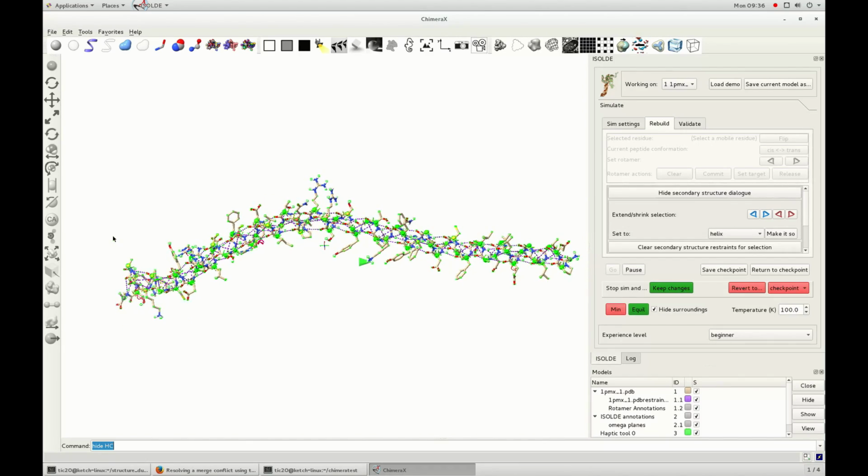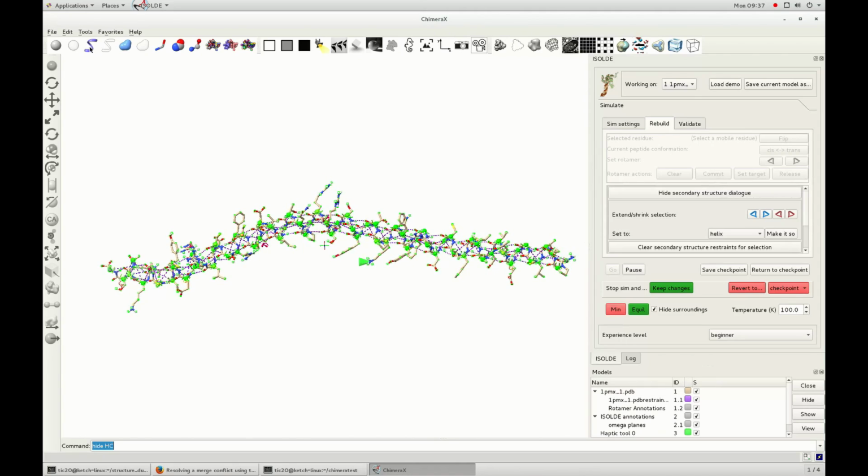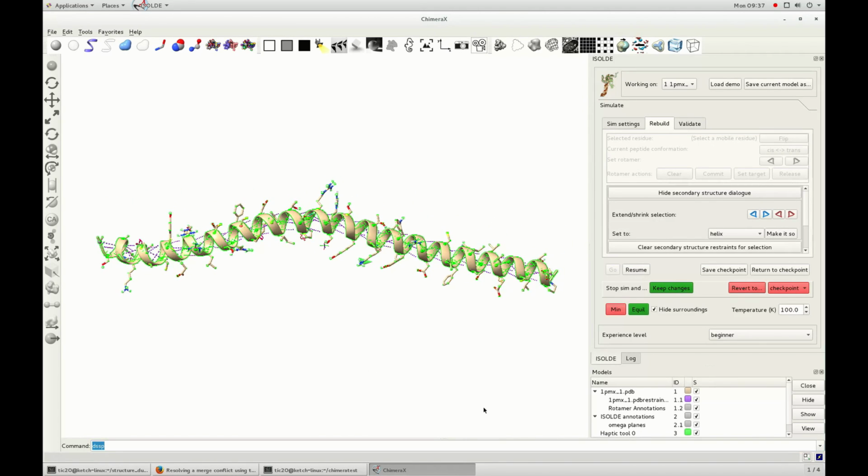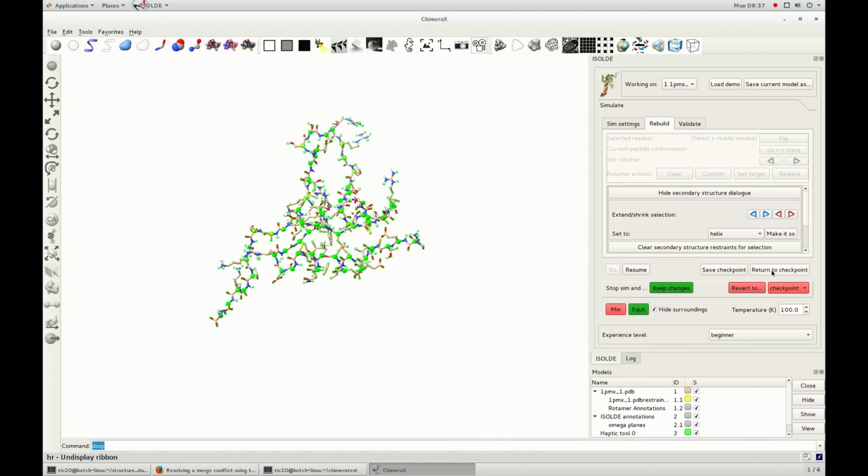And now you know what IGF-1 looks like as an alpha helix. Just to really demonstrate this, I'm going to briefly turn ChimeraX's cartoon representation back on and recalculate secondary structure using the DSSP command. Once done playing, just click Return to Checkpoint and it's like it never happened.